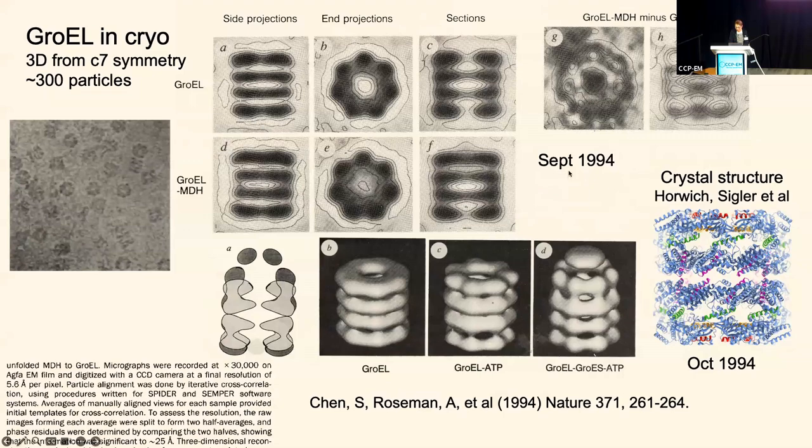And at this point, Neil and his colleagues, Tony Clark and his group, Neil was his student at the time, showed up with complexes where they had denatured malate dehydrogenase stuck inside this thing. So malate dehydrogenase is a substrate of GroEL, and GroES and ATP will fold it.